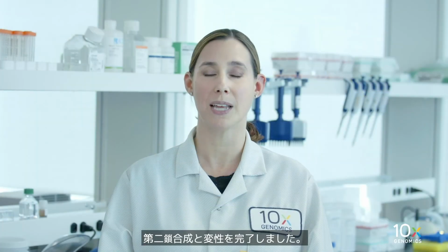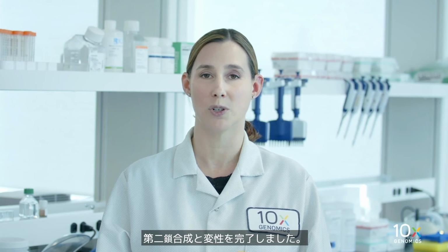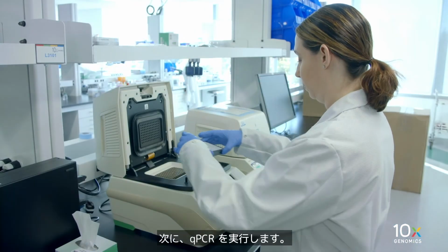We have completed second strand synthesis and denaturation. Next, we will perform qPCR.